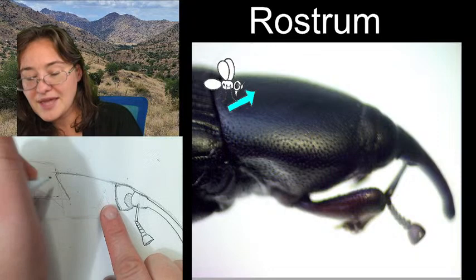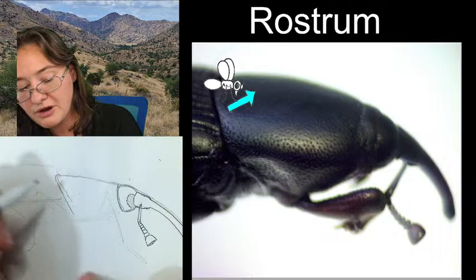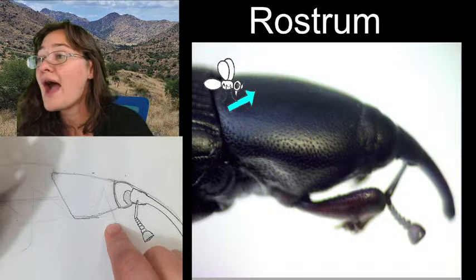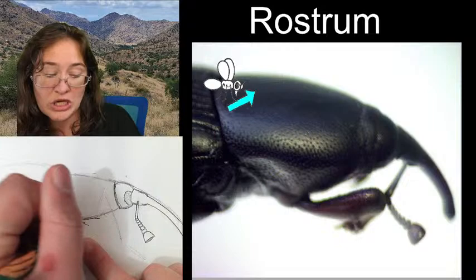So as you're going out, where it meets our second segment of the thorax, it's going to be kind of angled back in a little bit. And then it can kind of turn over and connect in the bottom. Our first pair of legs are going to be connected right here. And as we know, the hip bone is that coxa. So it's right here.